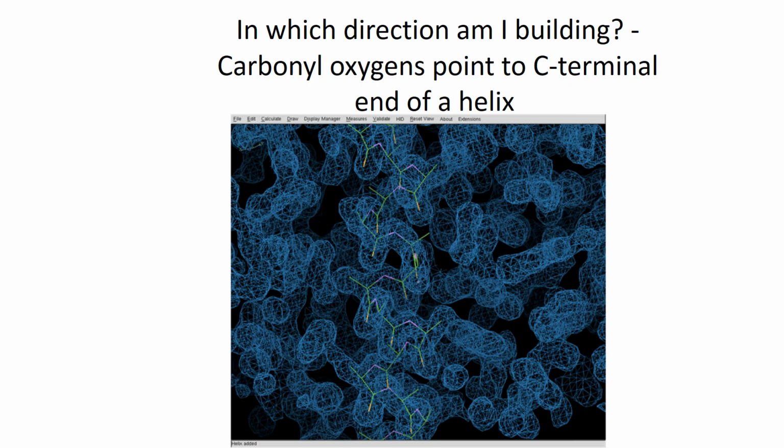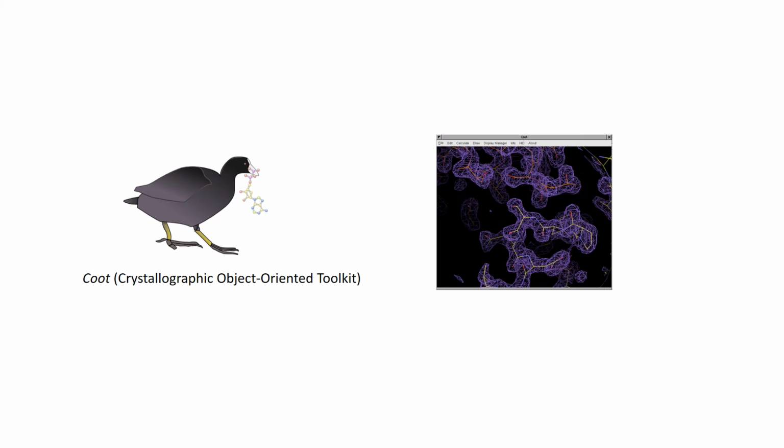Model building is a trial and error process, and an experienced researcher knows tricks to speed up this process. However, the most crucial part is still getting a density map with a good resolution in the first place. No one could build a reliable atomic model based upon a map with a 20 angstrom resolution. There are multiple packages available to the research community for model building. One of the most popular is COOT, developed by researchers in MRC.